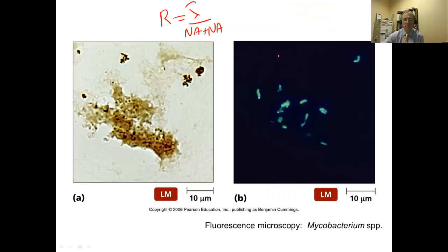The last kind of microscopy we'd like to talk about is fluorescence microscopy. That's also not a kind of microscopy that the microscopes that we have in Bio 230 will be able to accomplish, but it has a lot of utility within the clinical setting, so we'll speak of it so that we at least understand the basis of it.